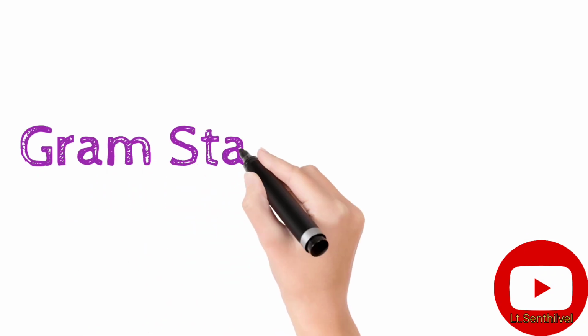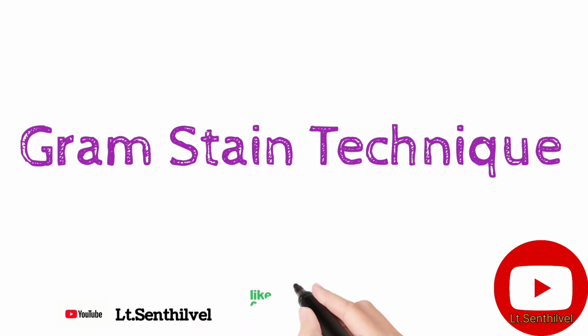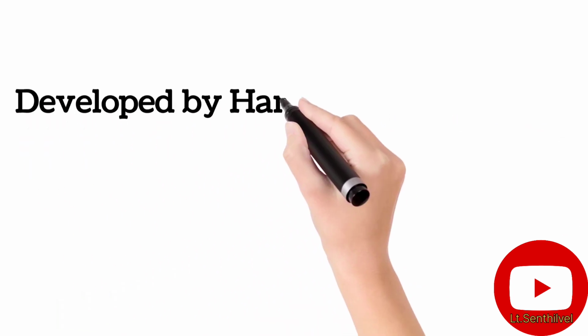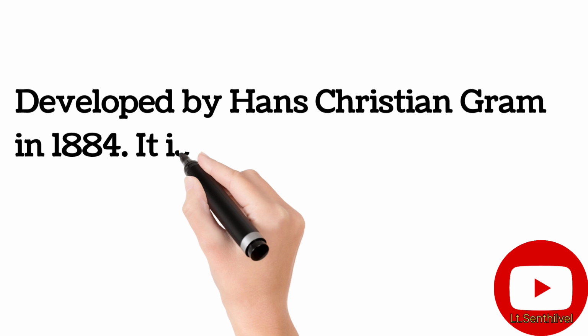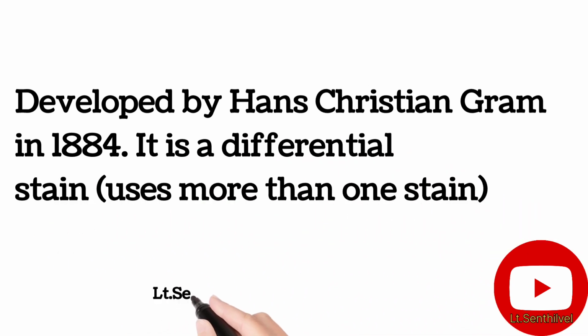Gram stain technique. Developed by Hans Christian Gram in 1884. It is a differential stain, uses more than one stain.